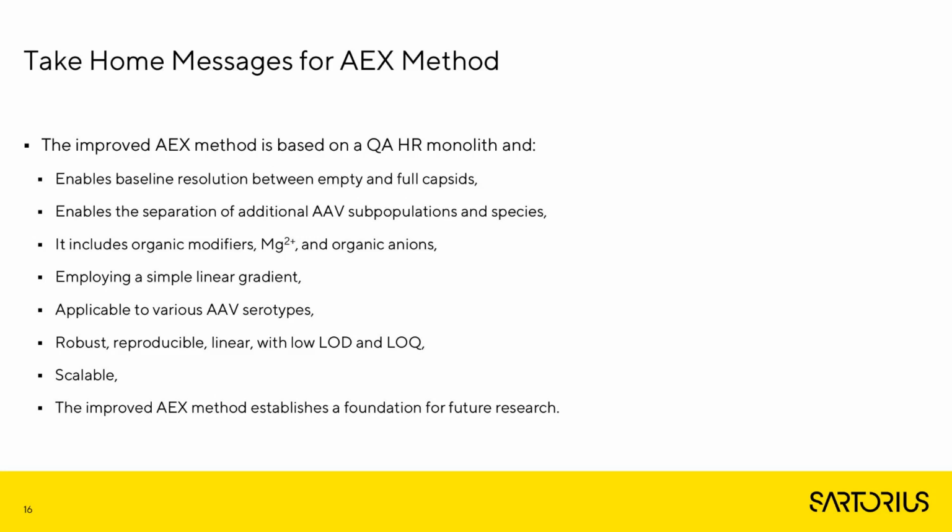The improved ion exchange method also establishes a foundation for future research and development between empty and full capsids. Now I will hand the floor to Sebastian, to give us more detail about the density gradient ultracentrifugation.